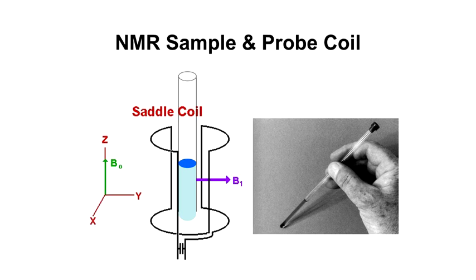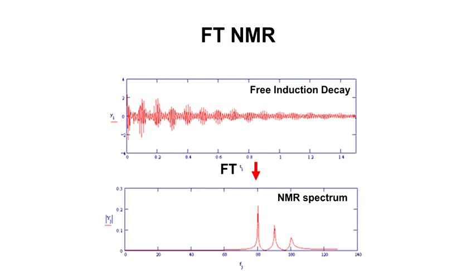So superconducting magnets made NMR much more powerful, much more useful, much more stable. Another critical development that happened in the 1960s that earned a Nobel Prize was the idea of Fourier transform NMR, which allows you to basically excite all of the signals, all of the components that are resonant, at the same time. And people have made it sort of the equivalent of trying to ring a whole bunch of bells at once and listening to all the bells ringing, or listening to a whole bunch of people in a room chatting and then tracking all of their voices in a voice readout.